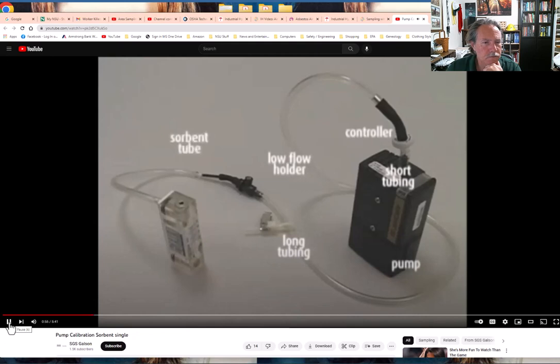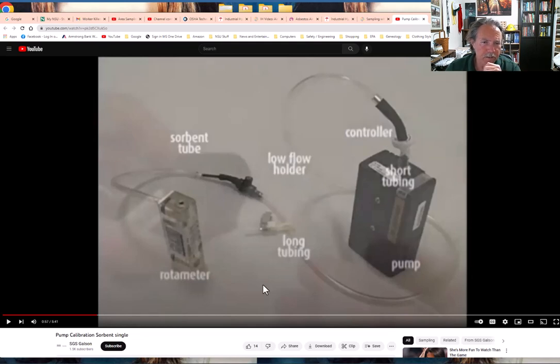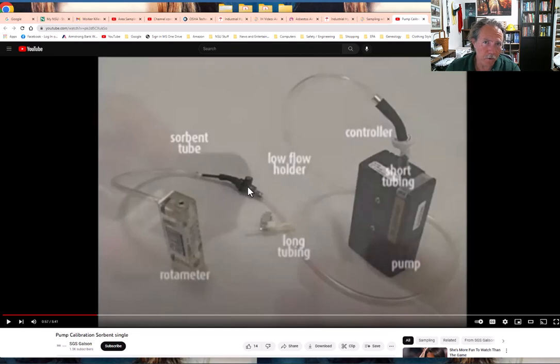Be sure to verify the pump flow rates using the tube and rotometer. The rotometer is the calibration device — it looks quite different from calibration devices we saw previously. There's also a low flow holder; the tube goes into that holder, and that's where you'll make your adjustments for calibration if needed.